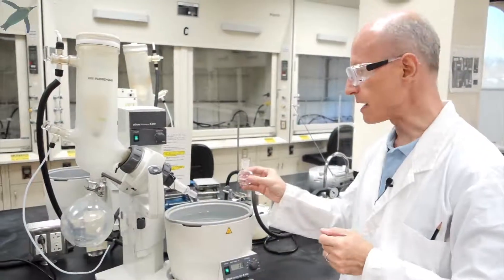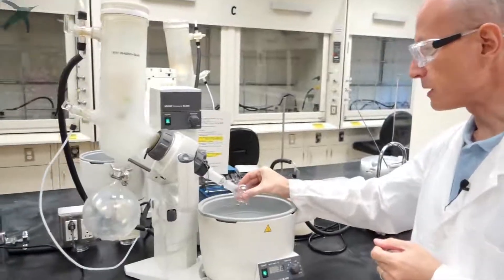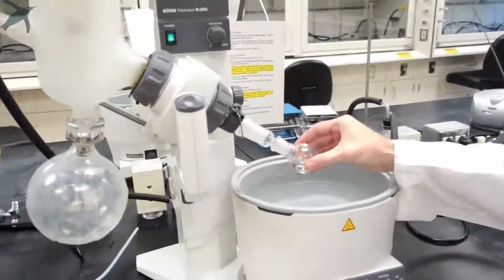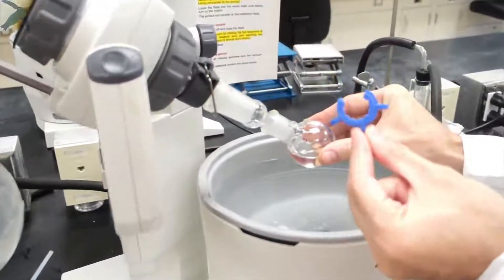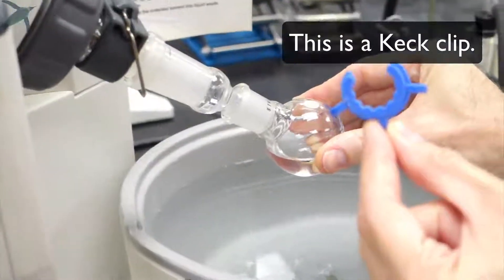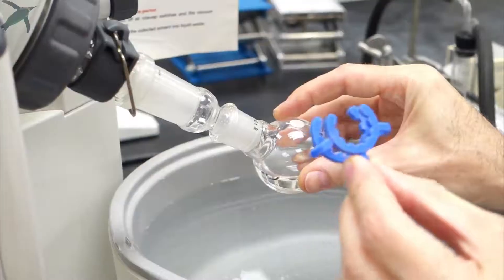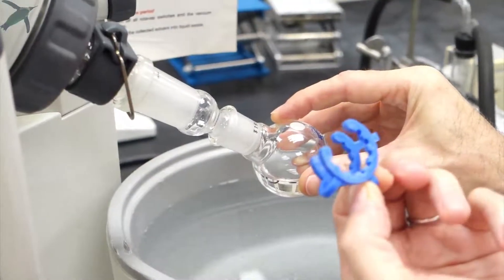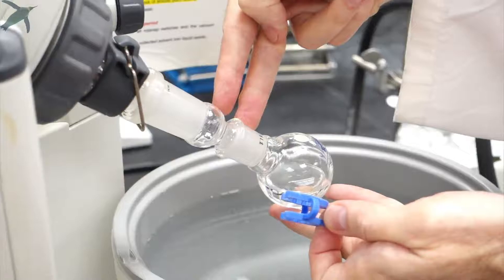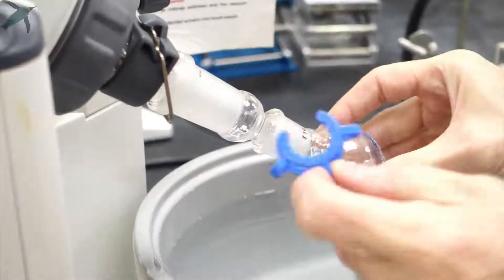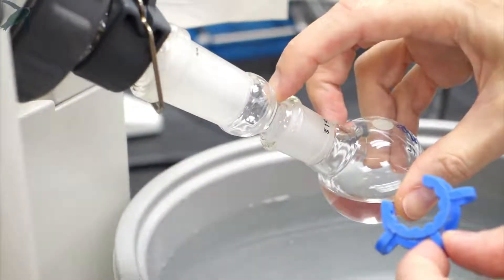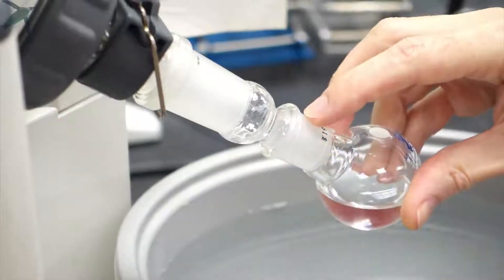To put your flask on the Rotavapor, you couple the glass joint and secure it with a keck clip. The keck clip has two sides: a small side and a large side. You want to straddle the joint and the small side goes on the small neck and the large side goes on the large neck.